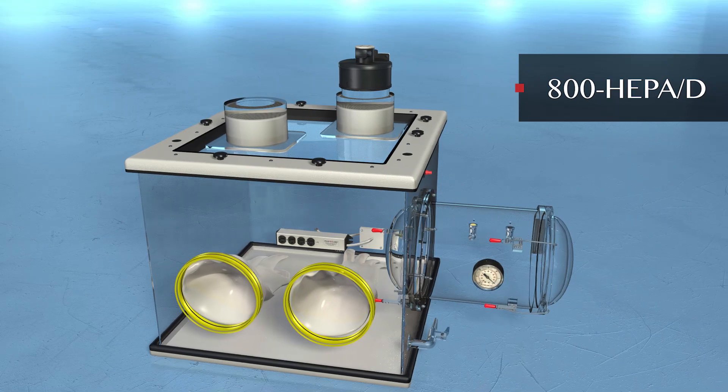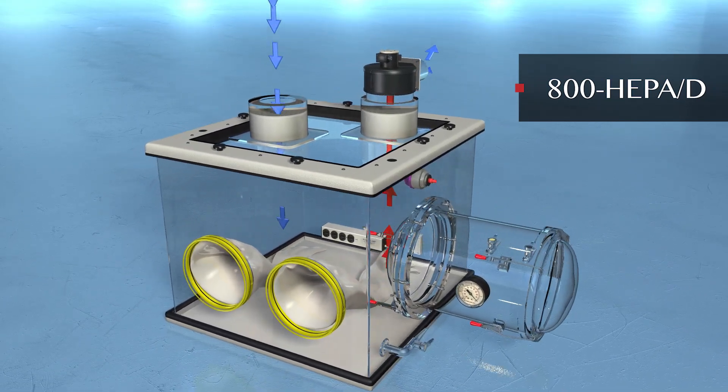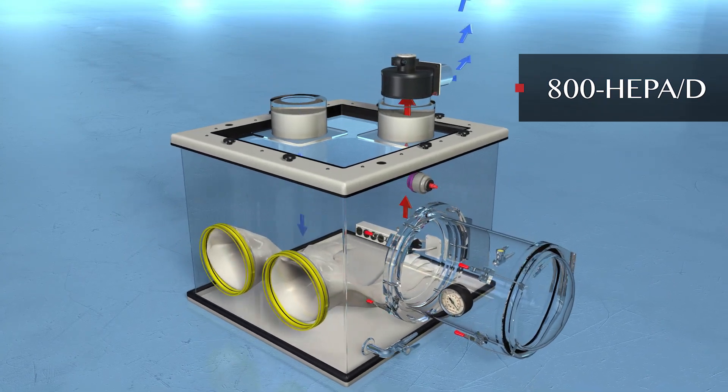800 HEPA D. Double HEPA filtration system provides HEPA filtered air into and out of the glove box.